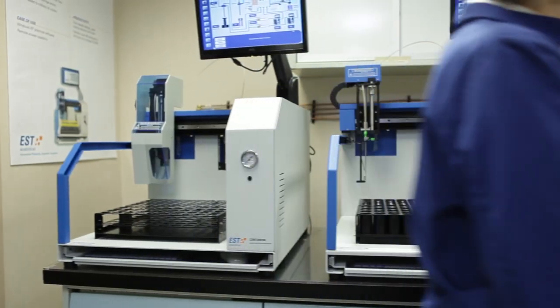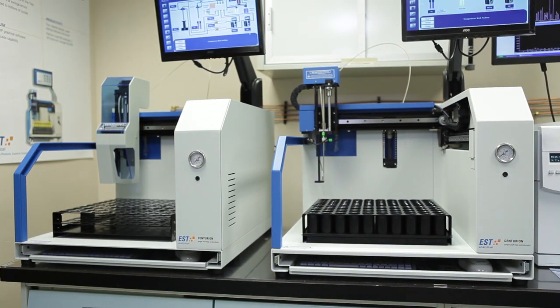The Centurion comes in two flavors. There is a water only model and a water soil version.